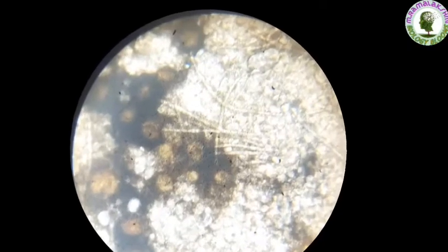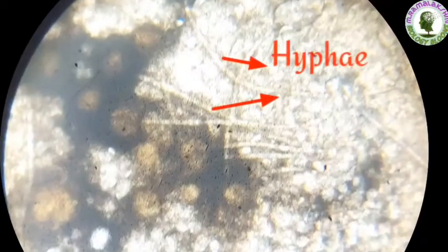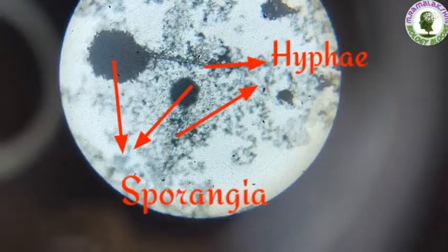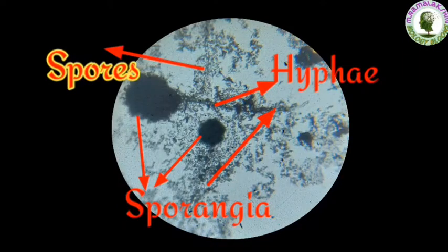The common bread mold consists of fine thread-like projections called hyphae and thin knob-like structures called sporangia. Each sporangium contains hundreds of minute spores. When the sporangium bursts, the tiny spores are dispersed in air.